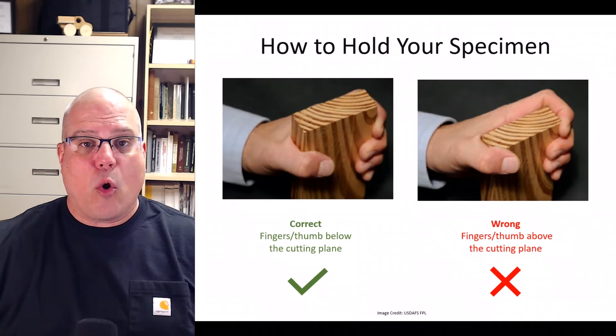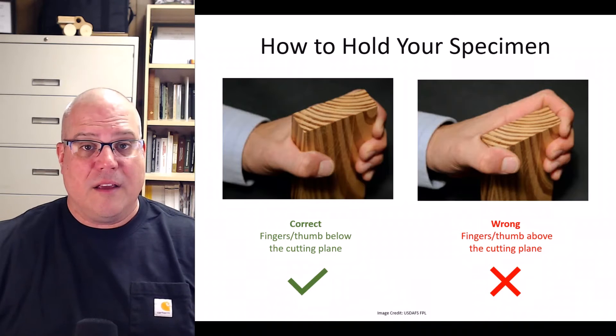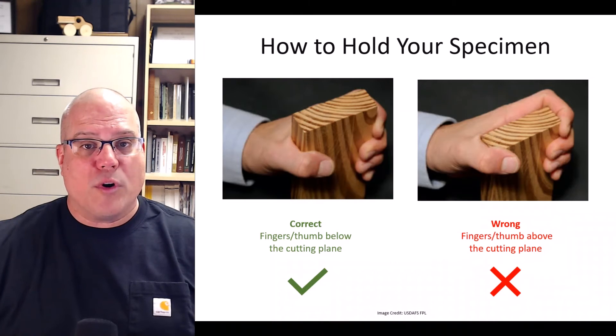First, you'll need to learn how to hold your wood specimen. If you're right-handed, hold it with your left hand. If you're left-handed, do everything the opposite way. When you grasp your specimen, hold it firmly and make sure you can see the arcs of the growth rings on the end facing you — that's the transverse surface. Make sure that no portion of your fingers or thumbs is above the transverse surface. As long as no skin is above the cutting plane, even if the blade slips, you shouldn't cut yourself.